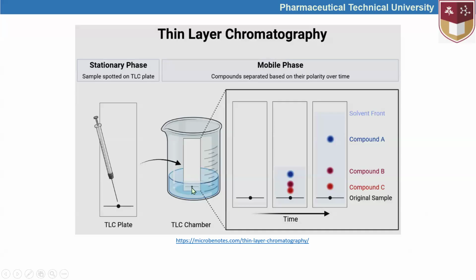So then we can expect the extracts to be separated by going up, getting washed with the eluent. Otherwise, if it's lower, by the time it gets up with the eluent, some amount could be mixed with the solvent inside it, so the separation may not be very appropriate.